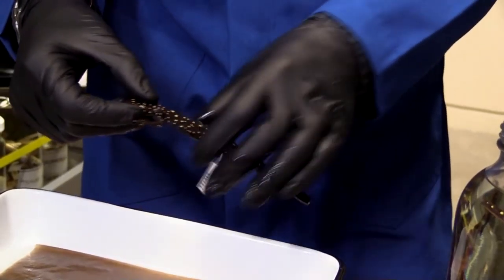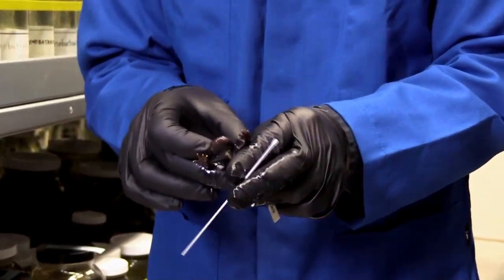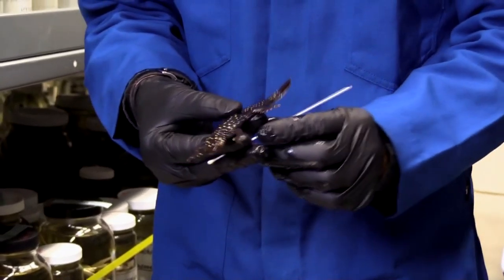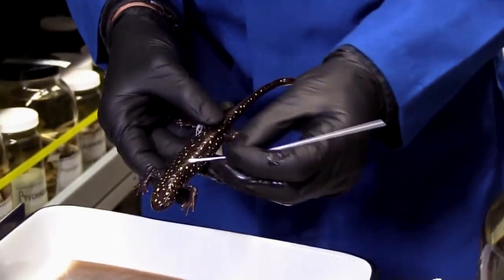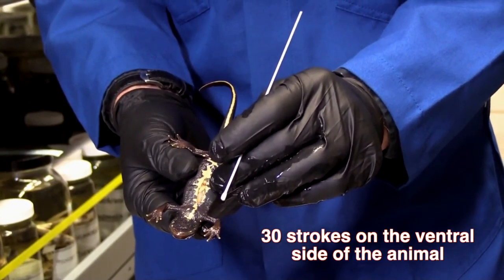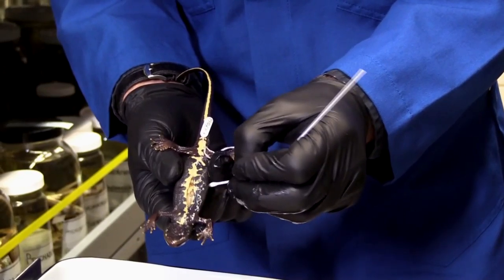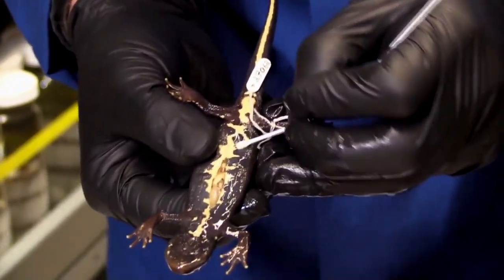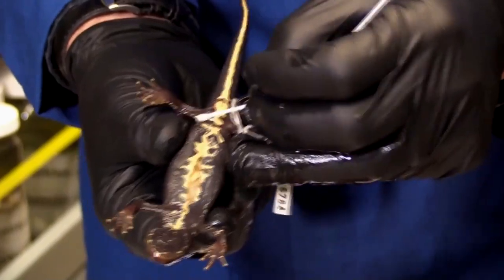Now I'm ready to collect the swab. These museum specimens are priceless — they're here for as long as we can keep them, so we want to be really gentle and really quick because we don't want them to dry out. I'm going to do about 30 strokes on the ventral surface, the bottom part of the animal, as opposed to the dorsal side. Notice you can almost hear it — you can hear me scraping the skin a little bit. Little tiny pieces of skin are coming off and getting stuck on my swab. It kind of feels like sandpaper, which is good — that means I'm getting some friction.